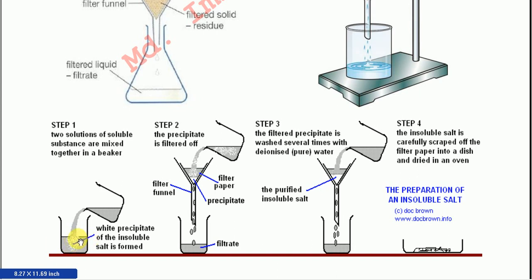Then the white insoluble salt is formed. Then you have to filter this white insoluble salt. That means filter the aluminum hydroxide gel. After filtering, when the filtration is completed, you have to wash the aluminum hydroxide gel with pure water, so that the sodium carbonate, potassium sulphate and sodium sulphate are washed away, and we only get aluminum hydroxide gel.